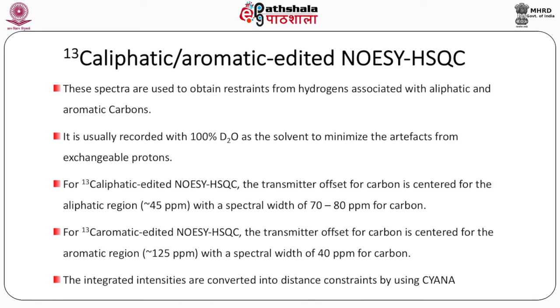C13 aliphatic and C13 aromatic edited NOESY HSQC. These are two different experiments. These spectra are used to obtain restraints from hydrogens associated with aliphatic and aromatic carbons. It is usually recorded with 100% D2O as the solvent to minimize the artifacts from exchangeable protons.